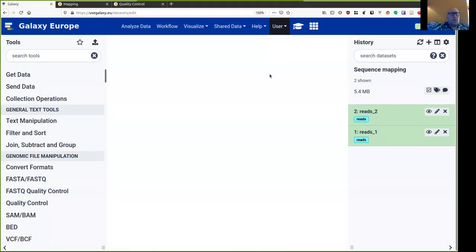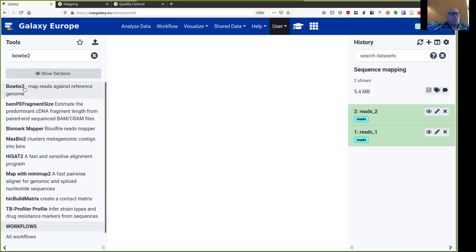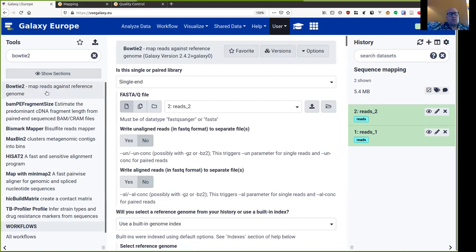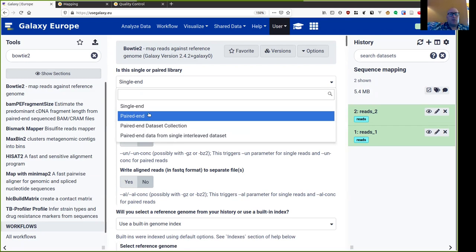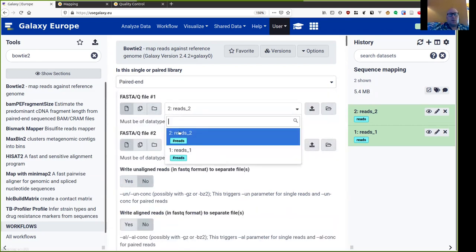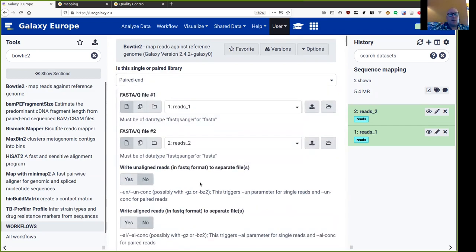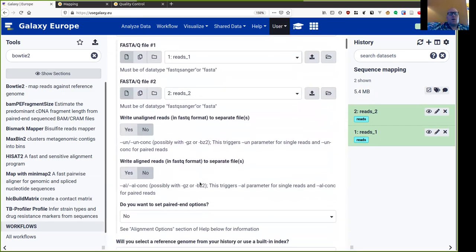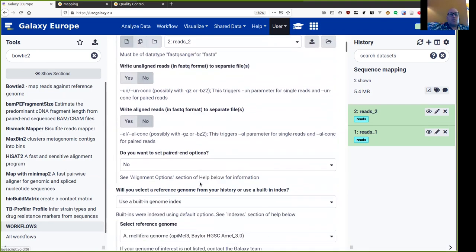There are many mappers available, but for this tutorial we'll be using one well-known one called Bowtie2. So let's find Bowtie2 here in the tools menu. And there it is. So firstly it asks us if our reads are single ended or paired end, and these are paired end reads. So let me set them up like that.